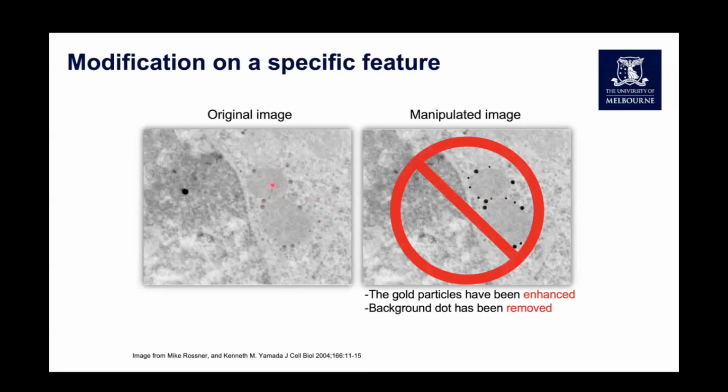If this hasn't worked, then they should go back and do the sample preparation or the sample acquisition again.